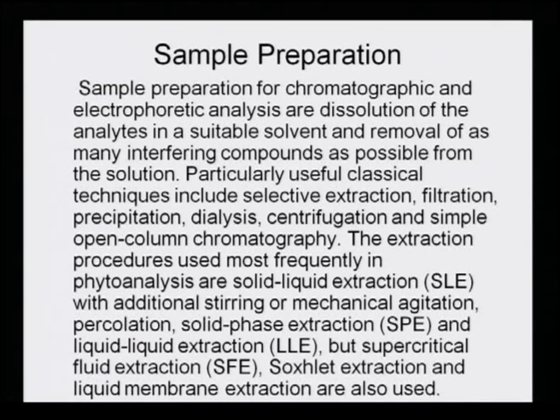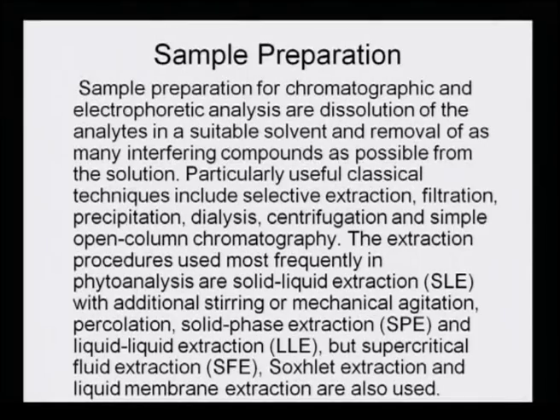Sample preparation for chromatographic and electrophoretic analysis involves dissolution of the analytes in a suitable solvent and removal of as many interfering compounds as possible from the solution. So, all the interfering compounds must be removed, and only the total extract or the electrophoretic or chromatographically suitable compound should come into the medium. Particularly useful classical techniques include selective extraction, filtration, precipitation, dialysis, centrifugation and simple open column chromatography.